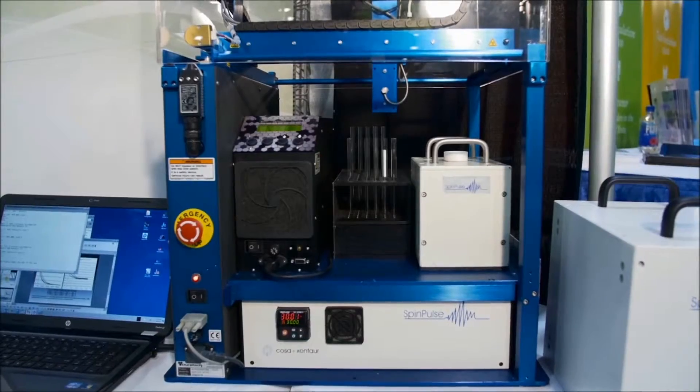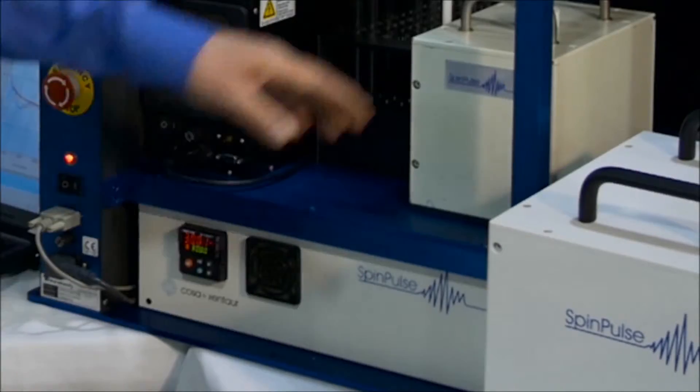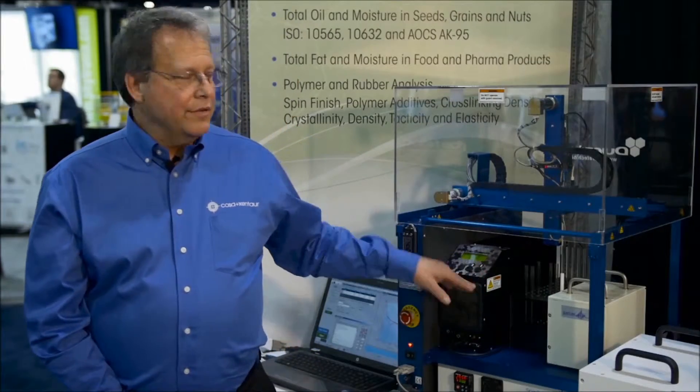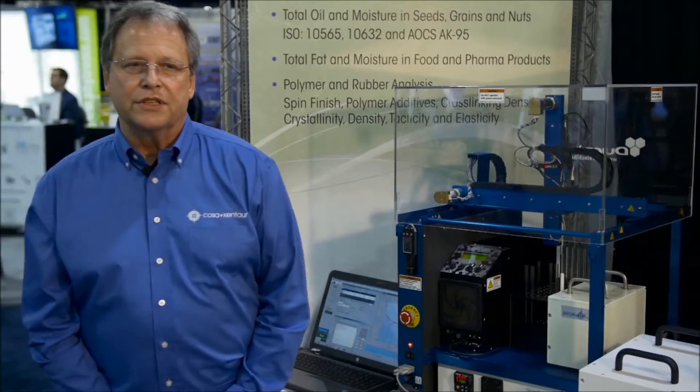The system consists of three or four items depending on whether you have an auto sampler or not. This is your spectrometer. You have a magnet, heater, the arm, and then of course a computer to control the system.